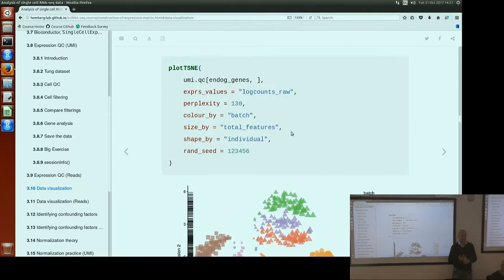So when you write the random seed, you see a name that run without conditioning. When we define the random seed, we actually say, instead of using your machine's random seed at the moment, use this random seed. So when you run it on your machine next time, on a different system, it will use the same random seed, so you'll see the same picture.